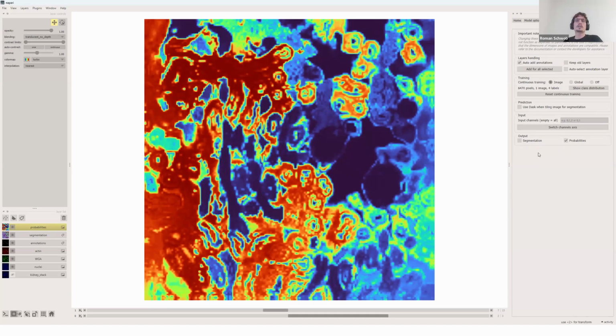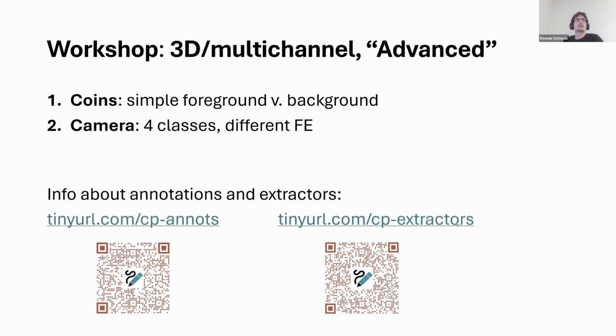And now I quickly want to show just one use case of how you can actually use, in a very simple and straightforward mini pipeline, how you can extract actual valuable information. So now we've just created those segmentations, and you might or might not wonder or know already what you could do with this. I just want to give you one example. So I'll just close Napari for a second.